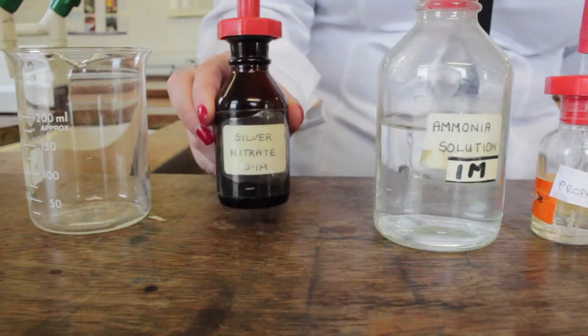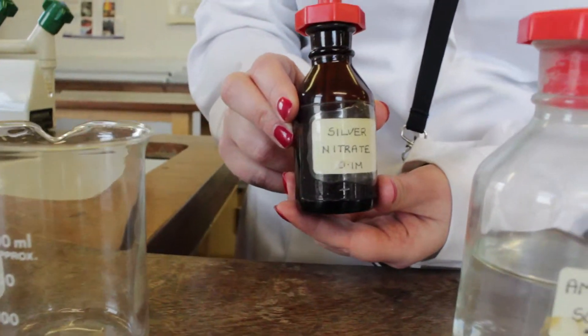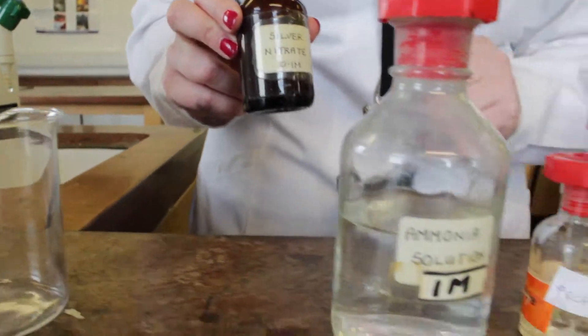We start by adding about two centimeter cubed of silver nitrate solution to our test tube.